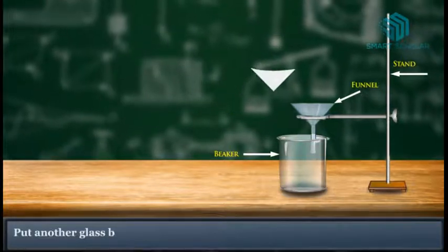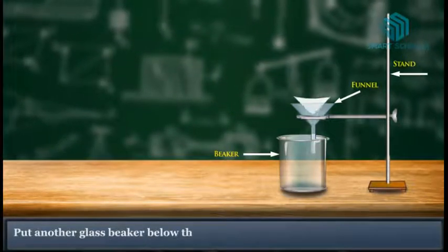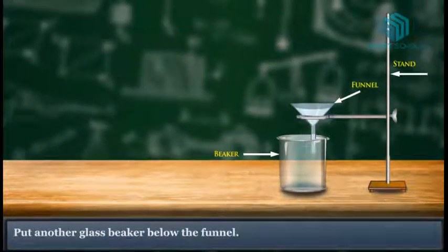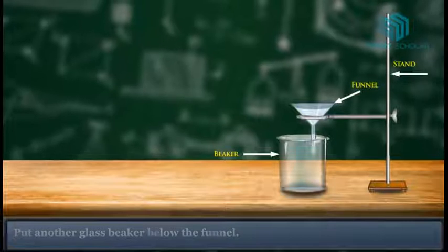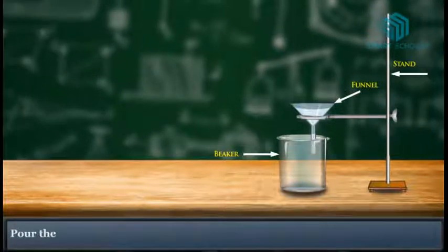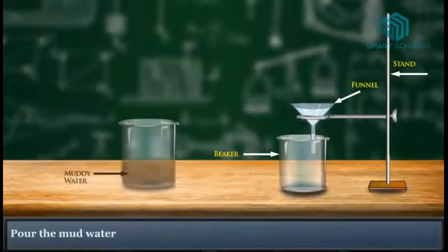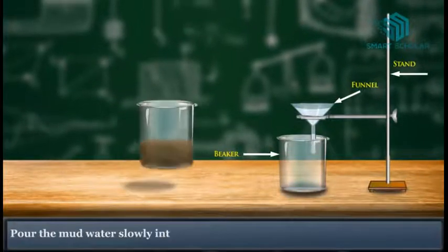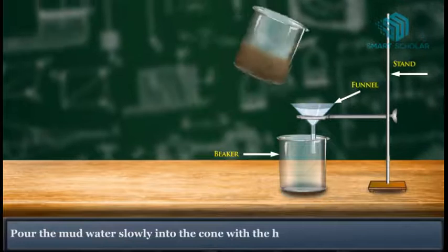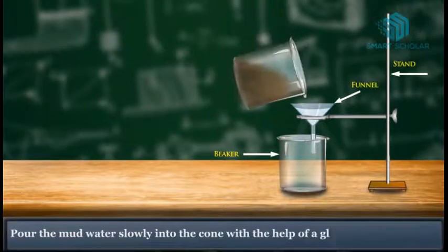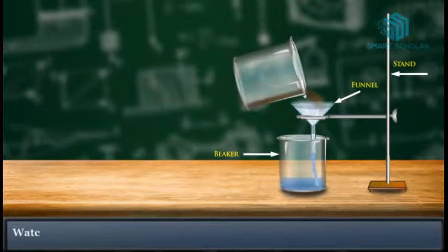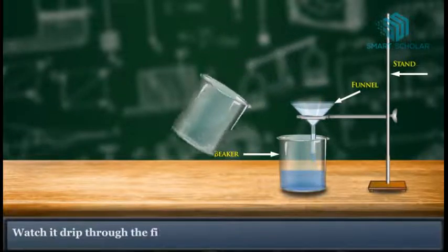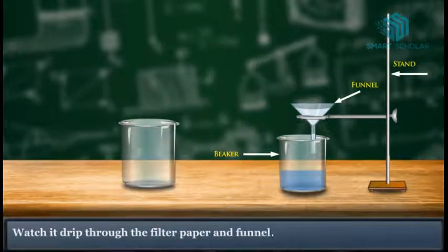Put another glass beaker below the funnel. Pour the mud water slowly into the cone with the help of a glass rod. Watch it drip through the filter paper and funnel.